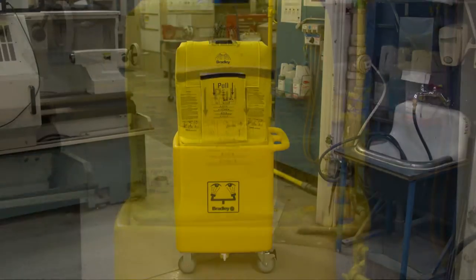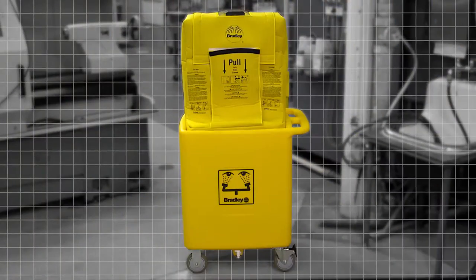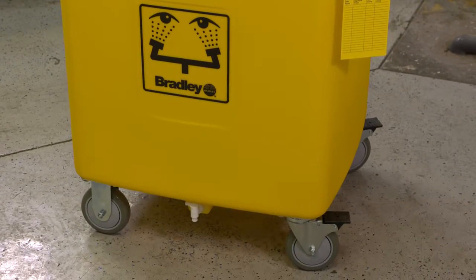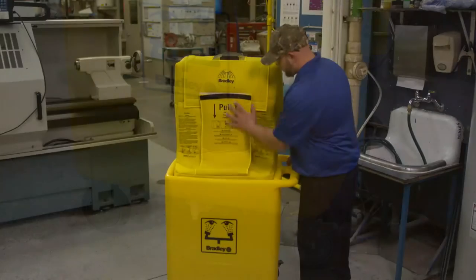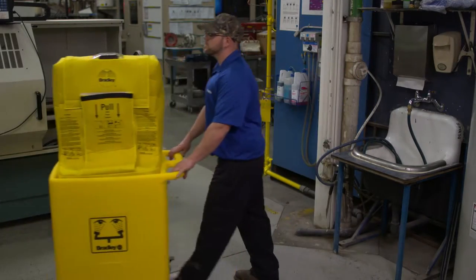Bradley recommends installing the eyewash with our on-site waste cart, sold separately. The cart ensures the eyewash is mounted at the right height, has a large 56-gallon capacity to collect water during testing and use, and it makes the eyewash portable, making it easy to relocate as hazards change in your facility.